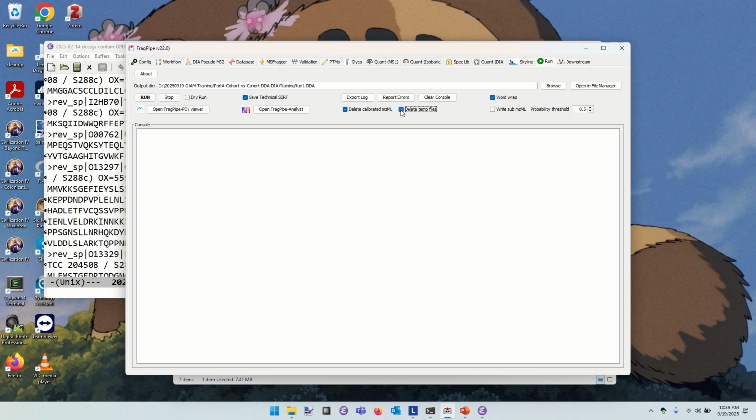Any questions for folks? Yes, you just provide it on the database page. You just specify the database that was on the thumb drive. Yeah, that looks correct. Yes. Okay. So with that, we should be ready to run.